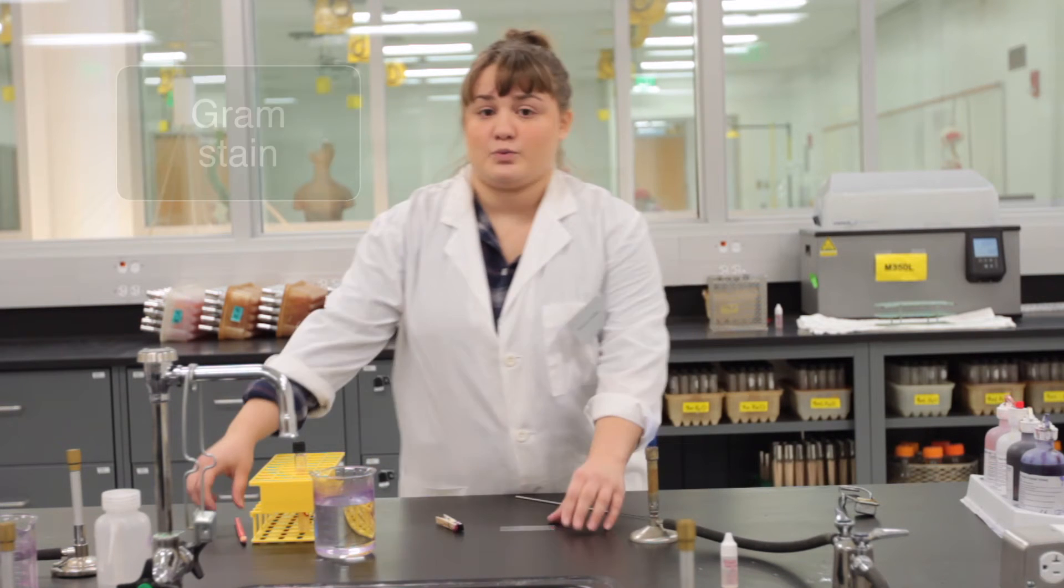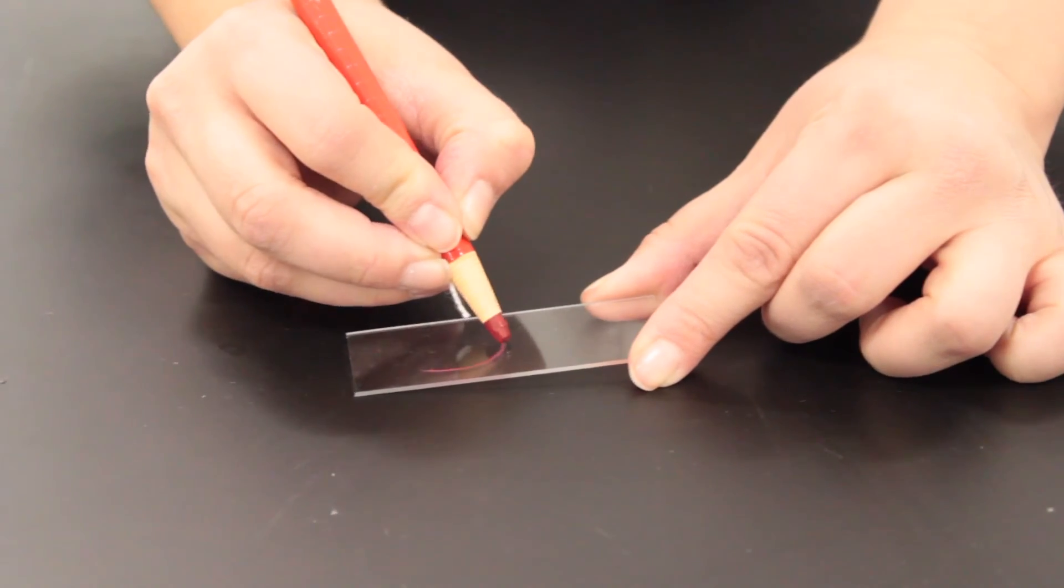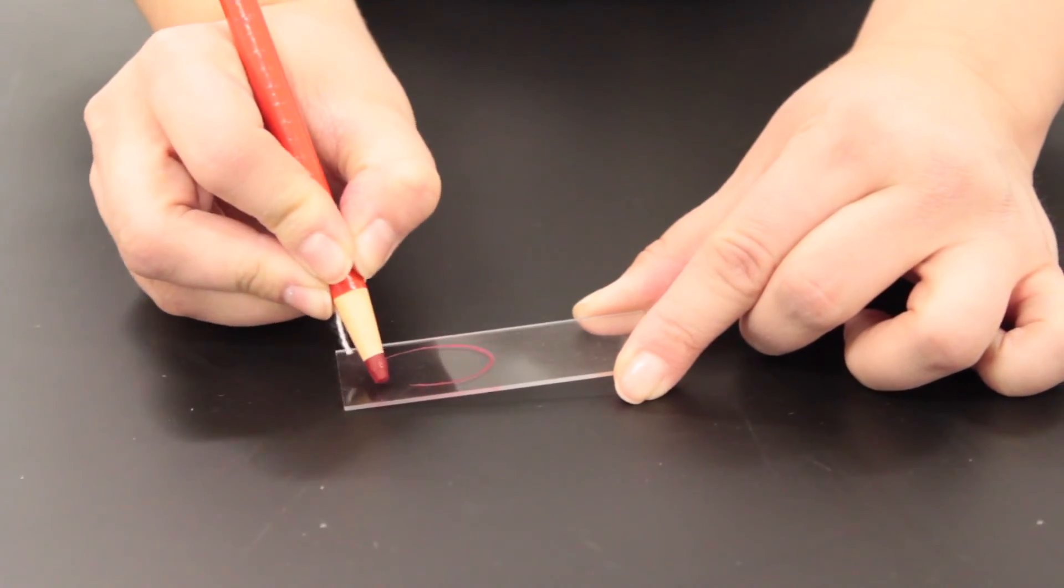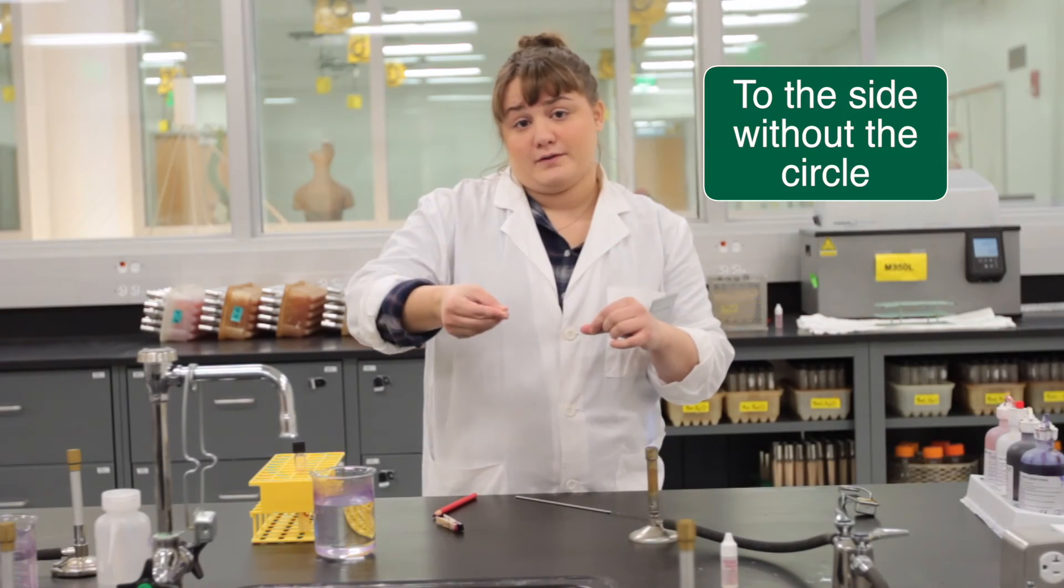First we are going to take our slide and a wax pencil. On the slide we are going to make a circle to denote where the bacteria needs to go, and then we are going to flip the slide over.